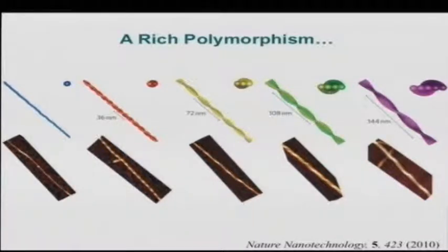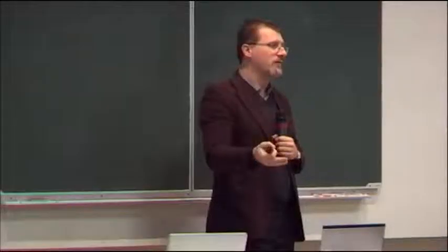In this case, if you keep the beta-lactoglobulin unfolding and aggregating for 5 hours, you get up to 5 protofilaments coming together and twisting. So you see that the pitch, the period, is increasing with the number of filaments. So it was quite an effort to get to this point. This is what you get if you do everything for 5 hours at 80 degrees.